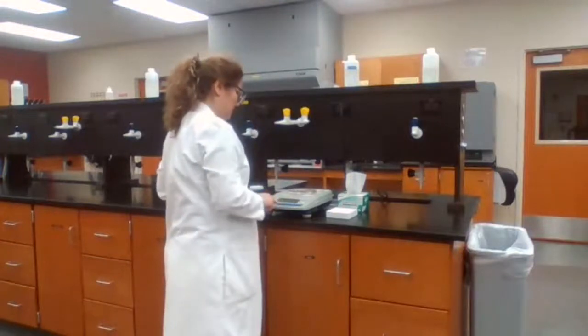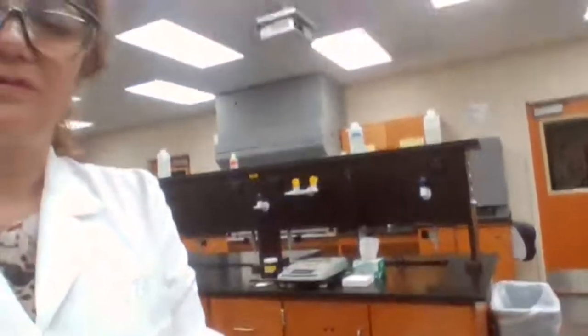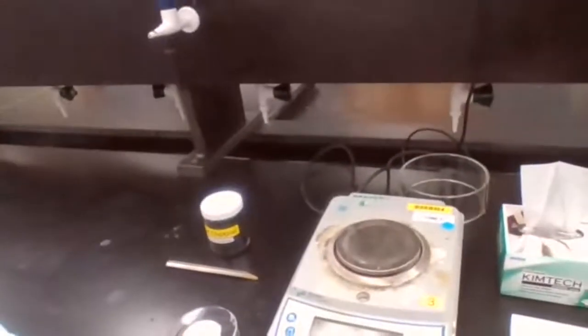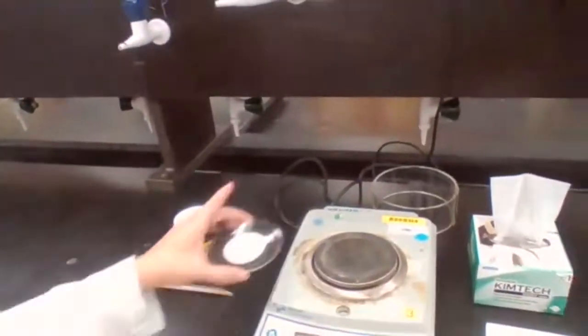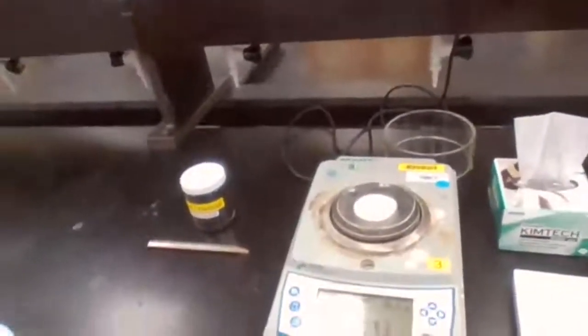First, with care. I don't know if you have used the balance already or not. I don't think for this experiment, right? You haven't used the balance for organic. So we are going to press the tare and weigh the watch glass plus the filter paper.